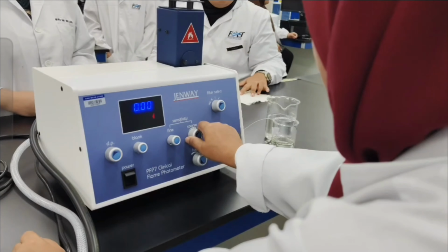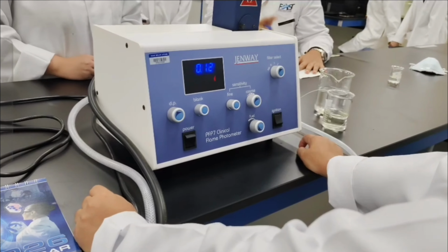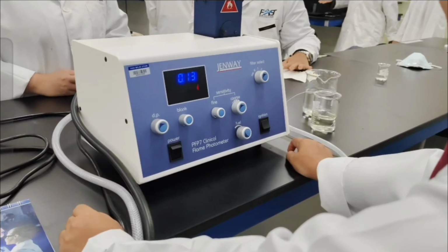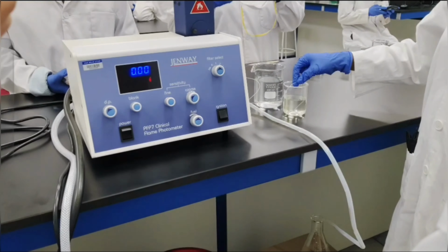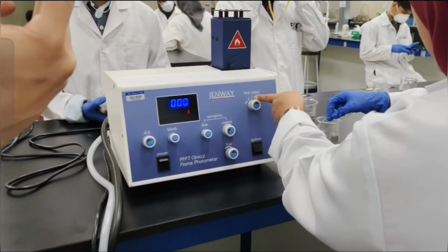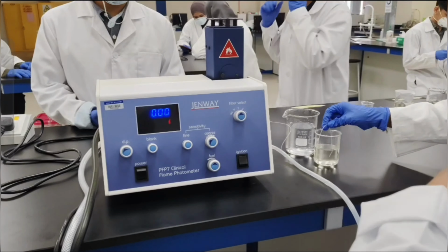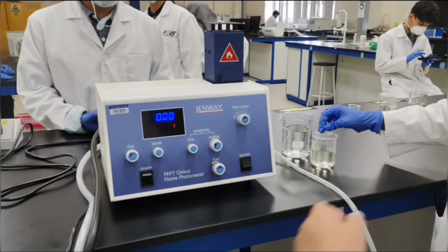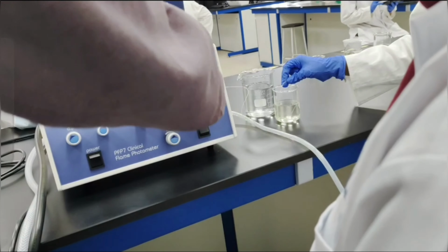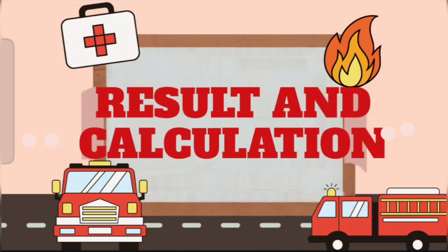Then we tune the instrument so that it will be suitable to analyze the concentration of Na in the sample. It can also be tuned for the concentration of K, kalium. Then we test for the concentration of natrium and potassium using the instrument, and the test is repeated 3 times each. The findings are recorded and tabulated in the table and the graph, for each concentration, to make a calibration graph for potassium and natrium.